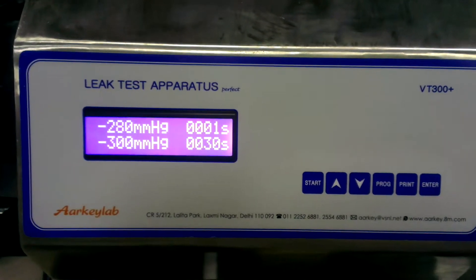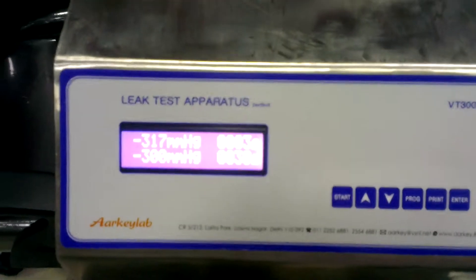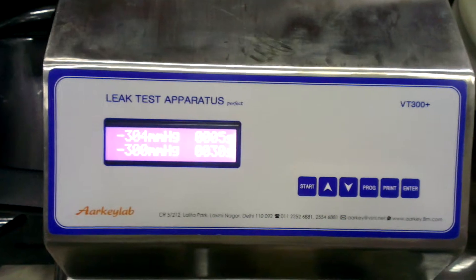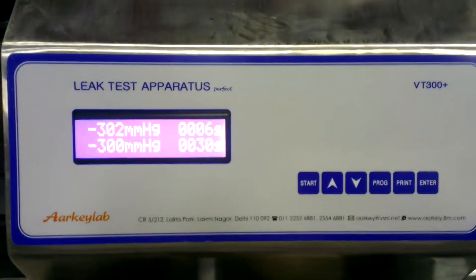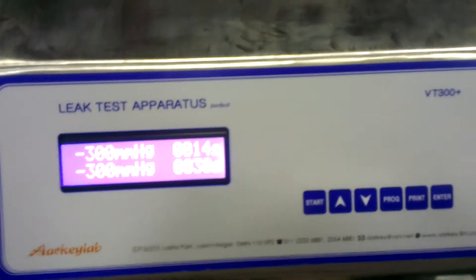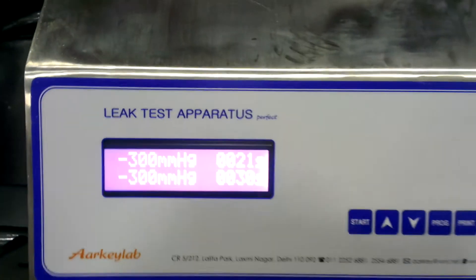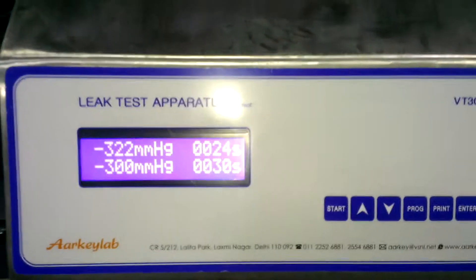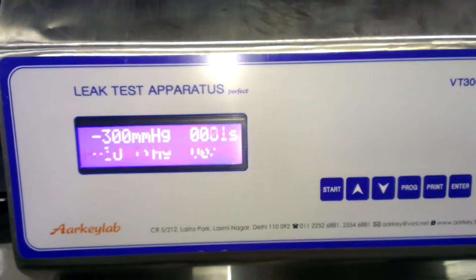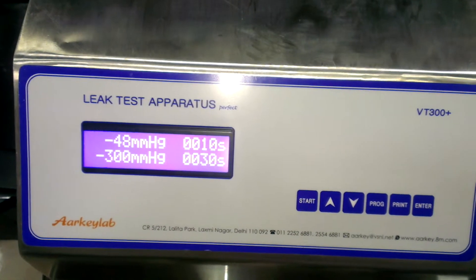It will maintain for the defined hold time of 30 seconds. This is the hold time — this is a fixed time. Now the vacuum is releasing after the hold time of 30 seconds.